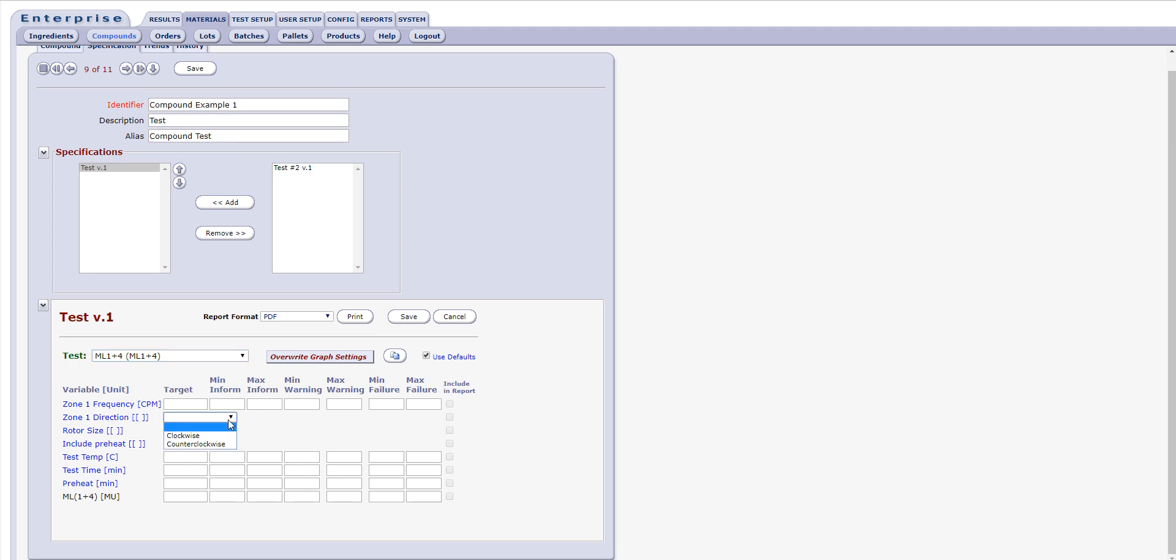Please be aware, however, that changes made here will be applied across all compounds that are linked to this specification. You may elect to change the settings for targets and the minimums and maximums for the variables within the specification.